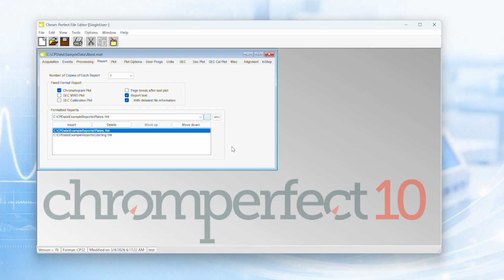Report settings affect output only. They do not change raw data, and they do not change integration. They define how results are presented.